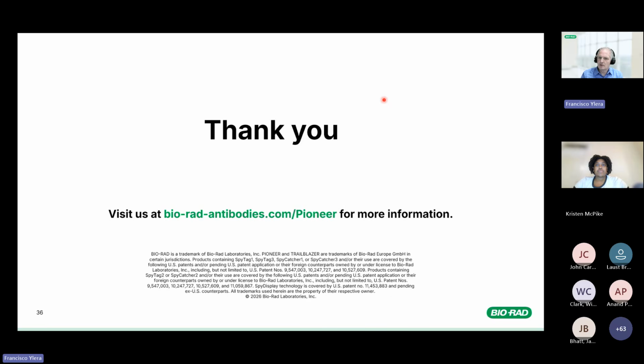And the selection, basically we performed the binding at the required pH, so pH 6, and we tested different blocking and elution steps.